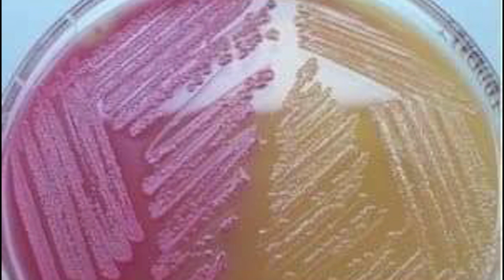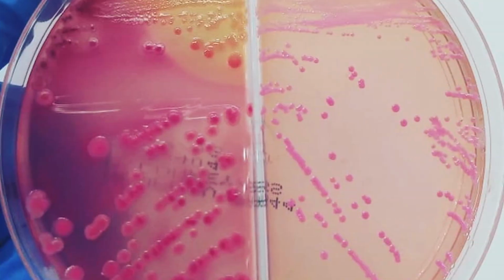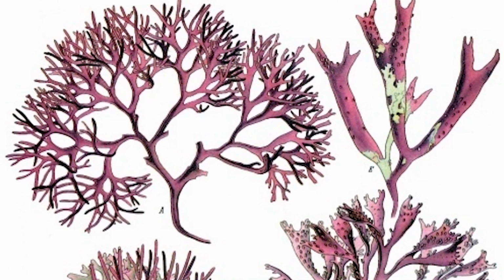colorless. Some of the bacteria produce very little lactic acid, so the colonies appear yellow or colorless after 24 hours, and change to pink after 24 to 48 hours. Lactose sugar and neutral red together make the MacConkey agar a differential medium to differentiate between lactose fermenting and non-lactose fermenting bacteria. Agar. Agar, or agar-agar, is a polysaccharide from red sea algae.